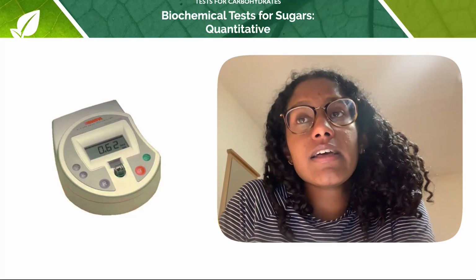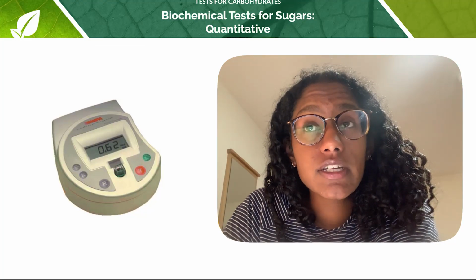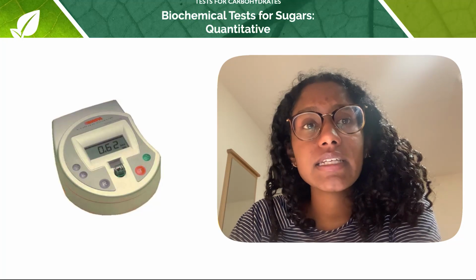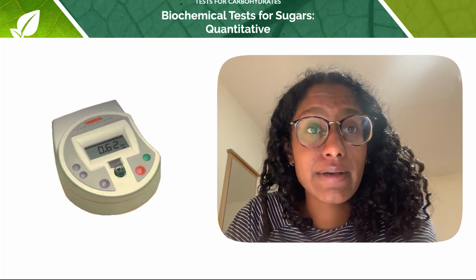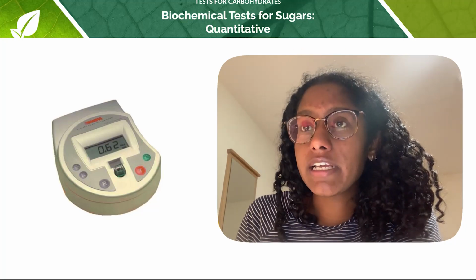All right, so now we've had to think about how we test for reducing and non-reducing sugars. We've had to think about how we test for starch. So now let's think about how we can quantify this. Now, all that means is getting a strong, hard value about how much of this starch or reducing sugar or non-reducing sugar is present in our sample. So something that we can use is colorimetry.